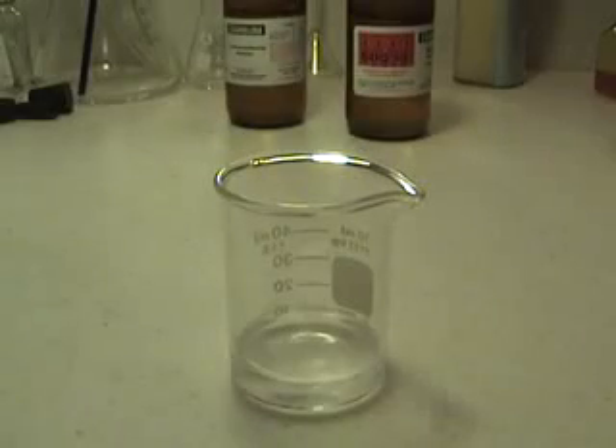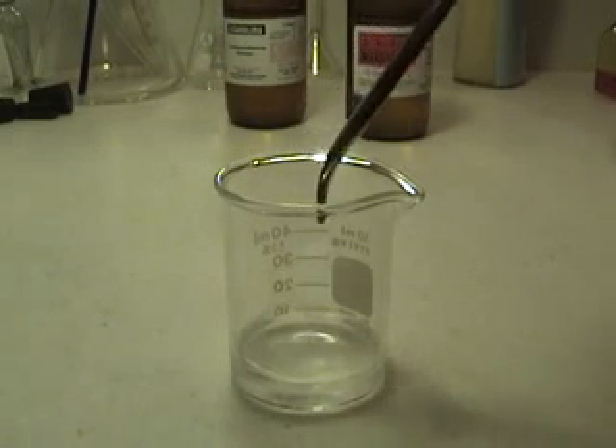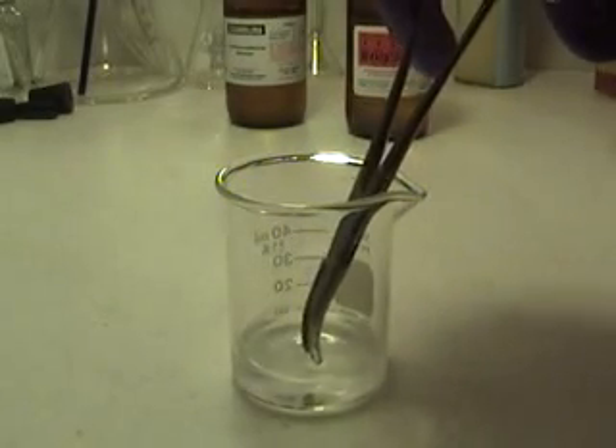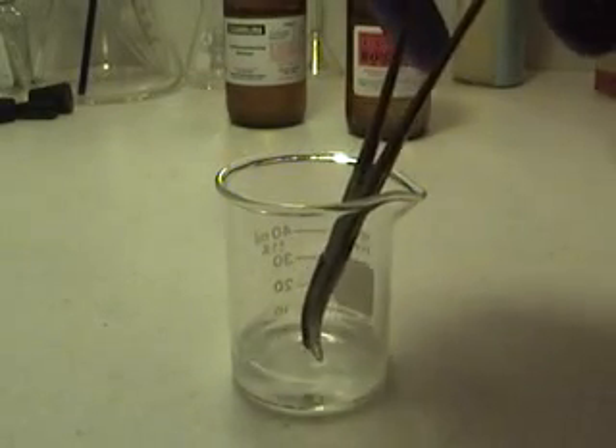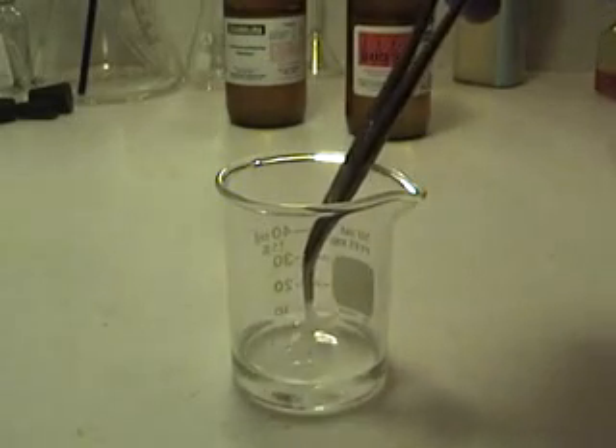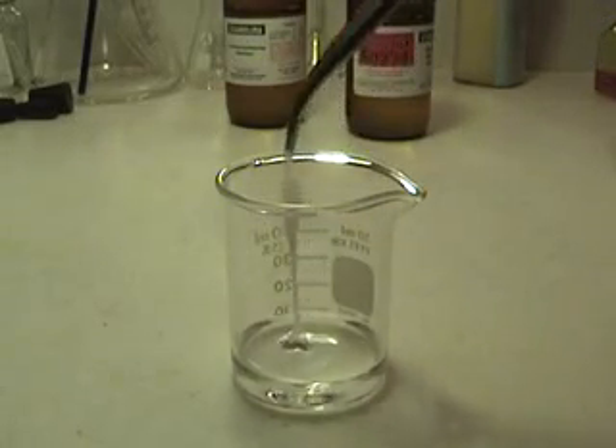Now we are going to attempt to take the nylon out and wrap it around a stir rod. So you want to take your tweezers or forceps and reach in and make sure you go down to where the two liquids meet. And you are going to grab that layer there and pull it out.